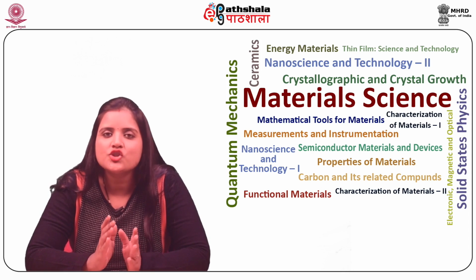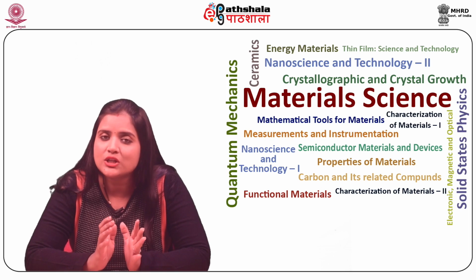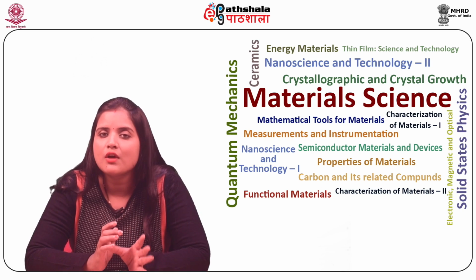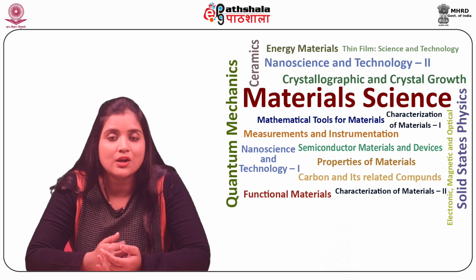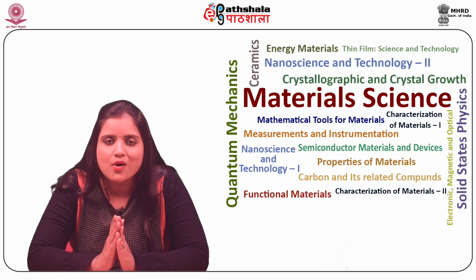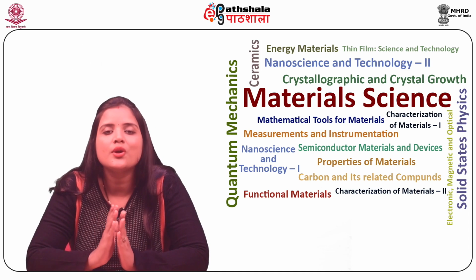Meng et al. chart the developments from film to digital chip-based holography for micro PIV experiments. In short, digital camera pixels needed to be sufficiently small to resolve micron scale objects. These cameras needed to have sufficiently fast frame rates for video imaging, and computers needed to be powerful enough to reconstruct three-dimensional electromagnetic fields in a time scale that was deemed useful.